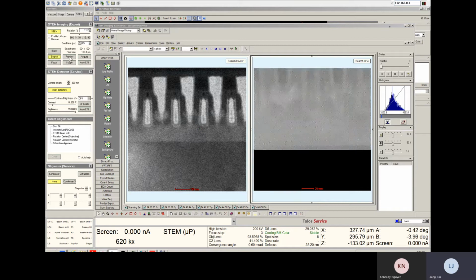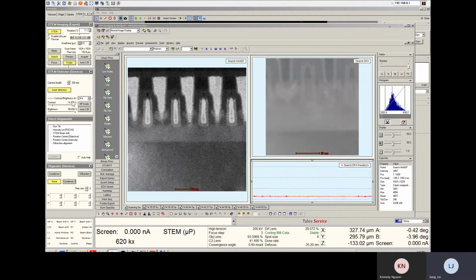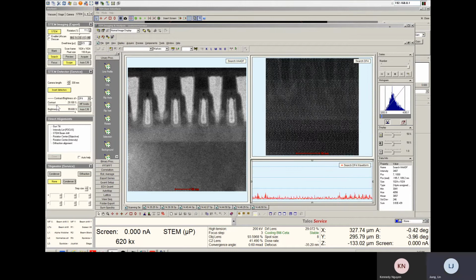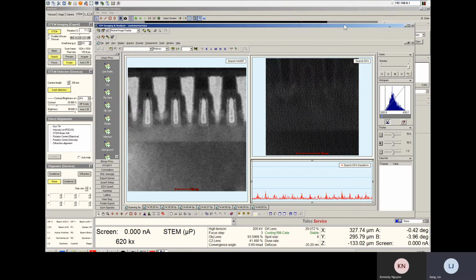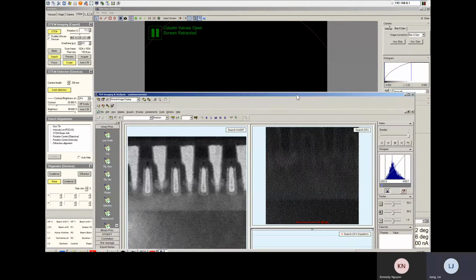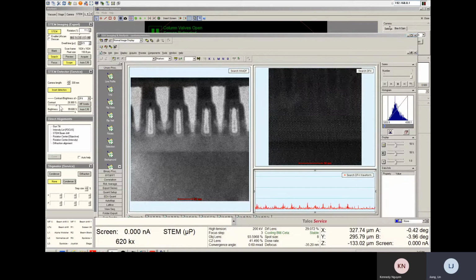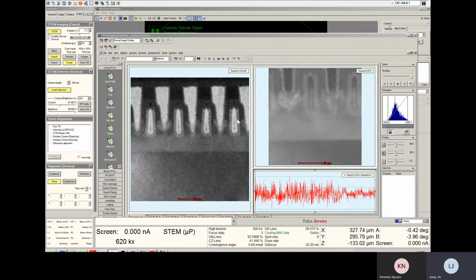Go search. You probably need to adjust the contrast for your scope tool. Increase the contrast. And also we need to adjust it, say if we can say that's cut out. We don't want to see that cut out, right? This should be fine. Okay, should be good.